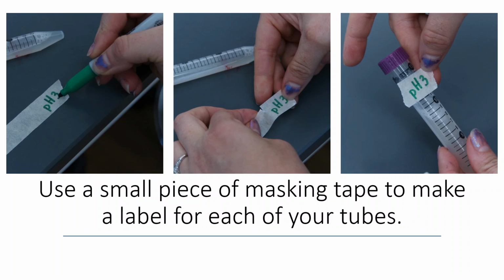Take it from someone who has made this mistake before. There are very few worse feelings than getting to the end of an experiment and then realizing you don't really know which tube is which, and then having to start all over from the beginning because you don't know what conditions were used for your results. So always get in the habit of the first thing you do being labeling your tubes right away.